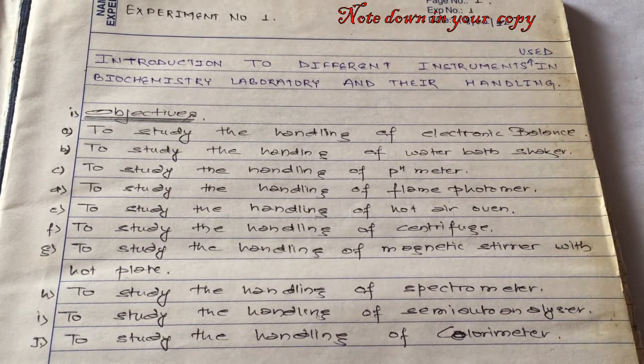Hello everyone, welcome to the class of biochemistry, and in this video I'm going to show you some of the instruments that are used in the biochemistry laboratory and their handling. Before beginning with the topic, let us begin with the objectives.